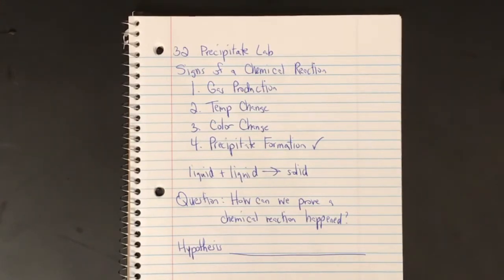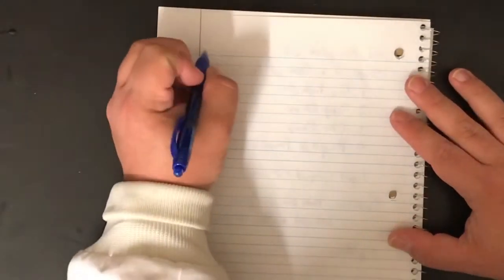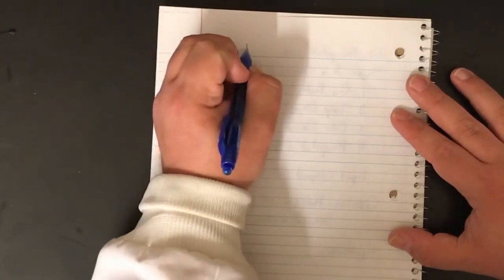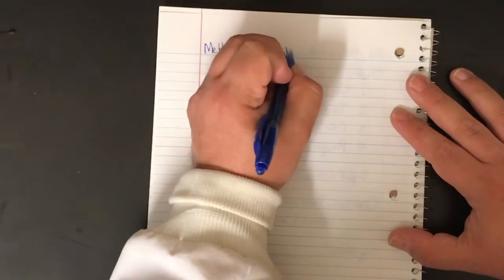But in order to prove that it was actually a chemical reaction, we have to prove that that solid is a new substance, not something that was already there. And so you're going to come up with a way to prove that, to show for sure that that is a new substance. So after the hypothesis, as you guys know for sure by now, we are going to write down our methods and materials, or materials and methods, whichever you prefer.